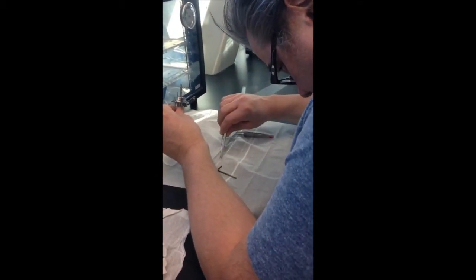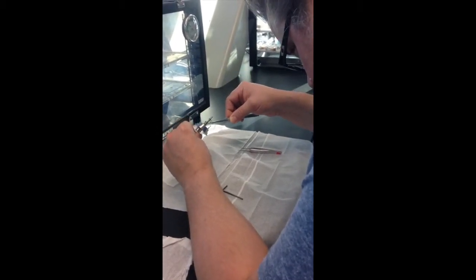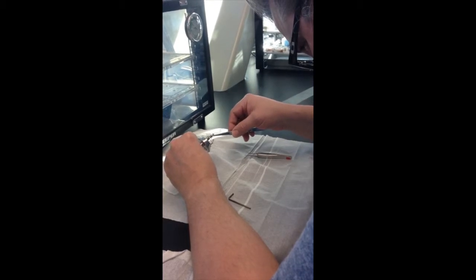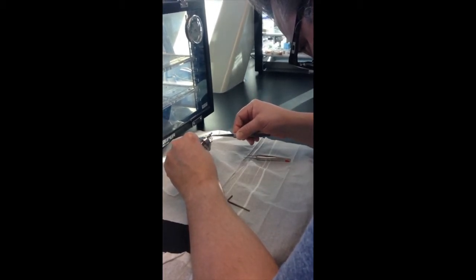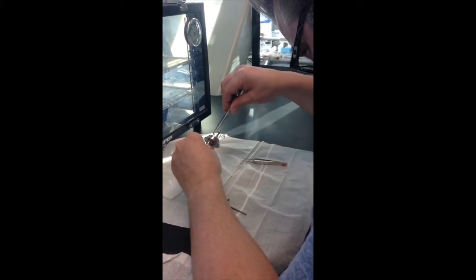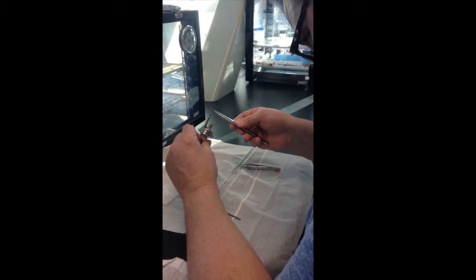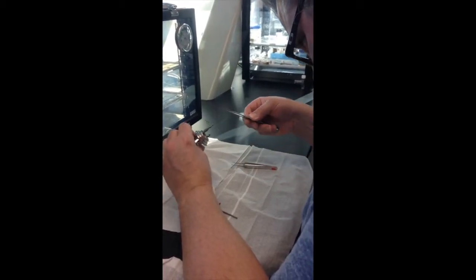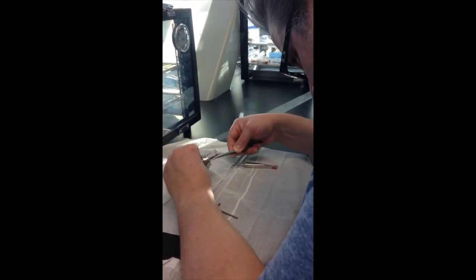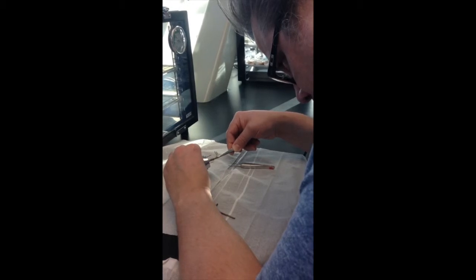Start by wrapping one end of the fuse around one of the bomb terminal prongs without touching the fuse or anything else inside the bomb. Connect the other end of the fuse to the other terminal in the same fashion — again, not touching it.